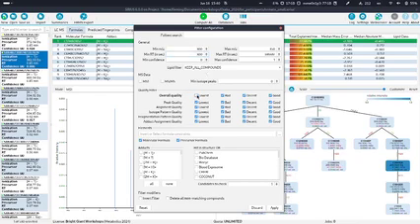Maybe we can also exclude all the lowest quality hits. What is also a good idea is that we might only want to show compounds which actually have MS data. Kai already talked about this. So to do this, we can use this option here.